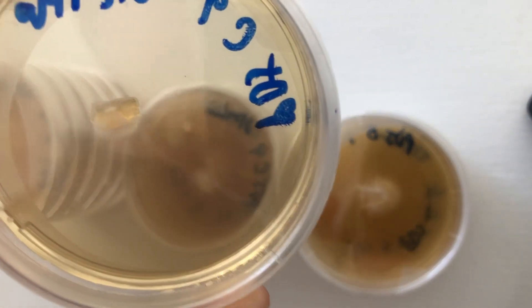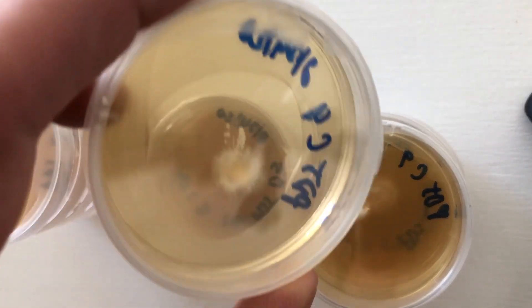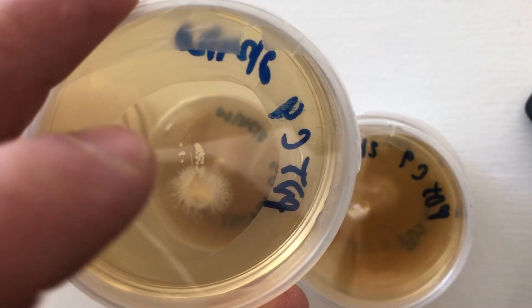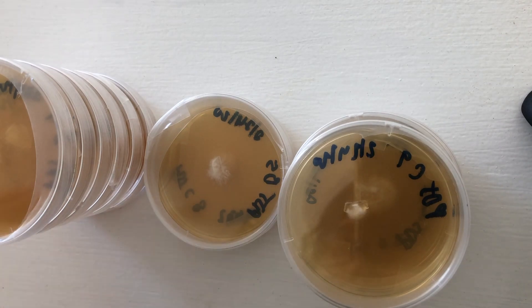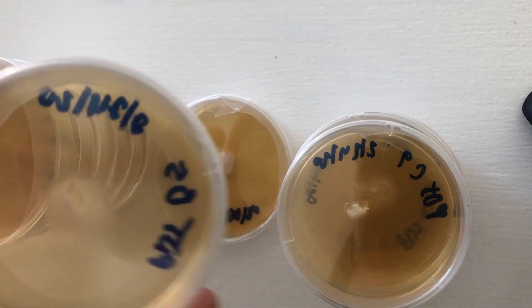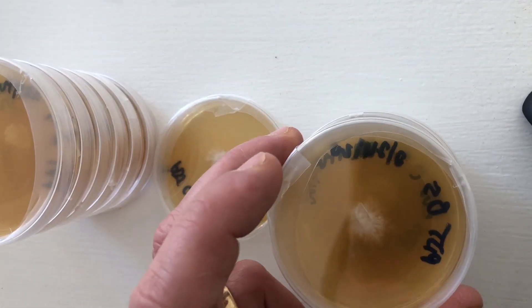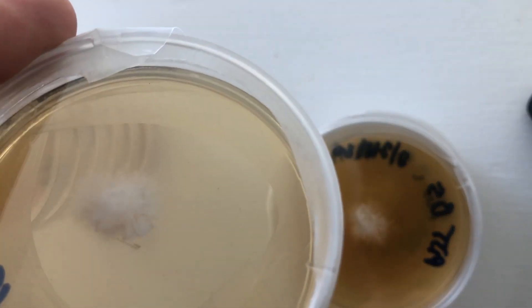Each of these has its own differences in genetics, and then we're going to systematically combine all of these. There's a little bacteria in this one, so I'll set this aside. Ideally you want clean colonies with no bacterial growth — that's actually a good selector, as it indicates resistance to bacteria.